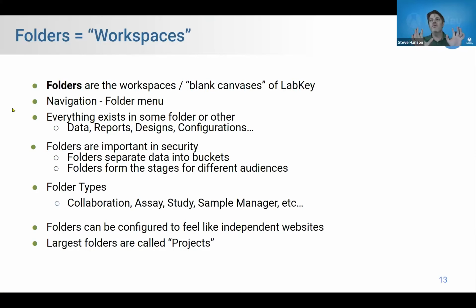Folders are super important for security. They are how data is separated into buckets. Each folder is potentially like a different website, essentially, that can be independently secured and be given to a target audience. I think of each folder as a stage that a different audience can be admitted to view.